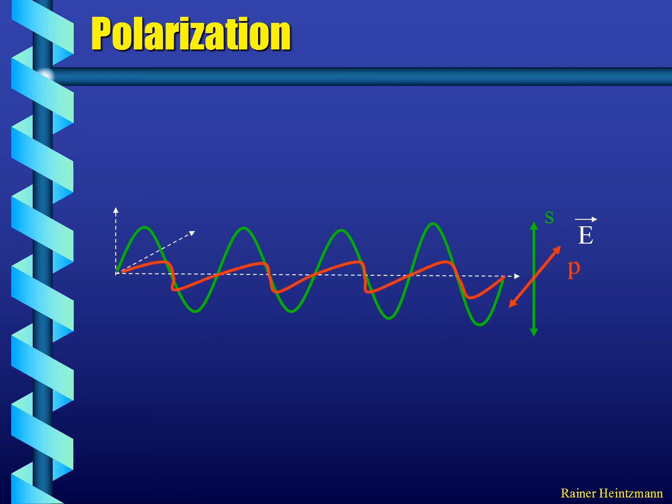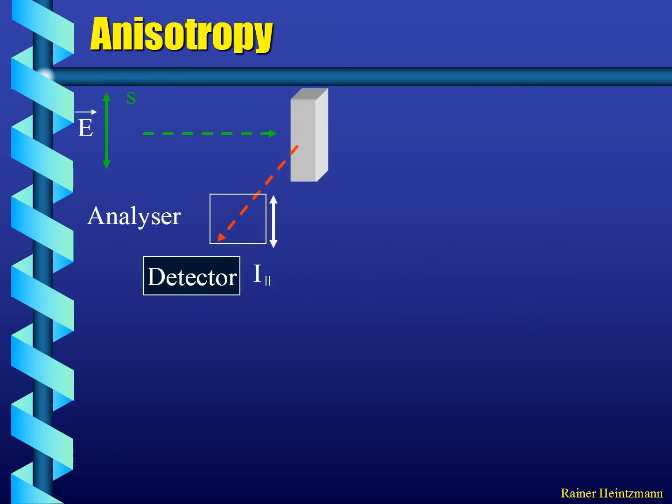So how would you do that? Well, you know about polarization. There's S and P polarization of the electromagnetic field, and if you have here, for example, a cuvette, you're exciting it with one particular polarization, S polarization, and then you can detect either S, like before, or P polarization if you're rotating your analyzer in this particular case.